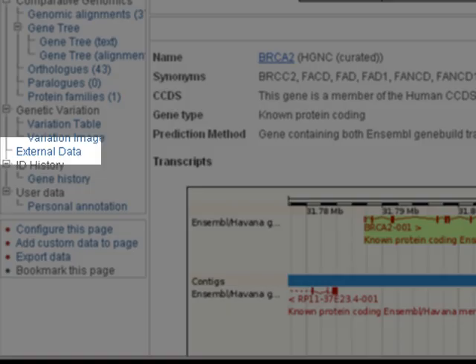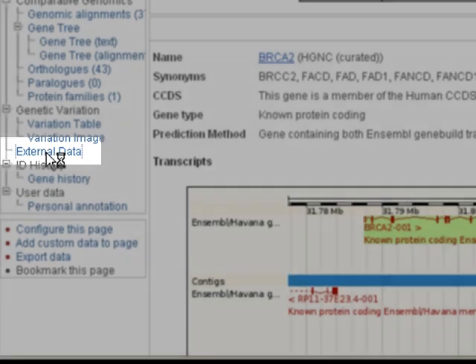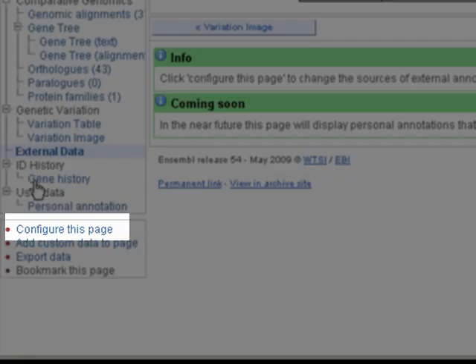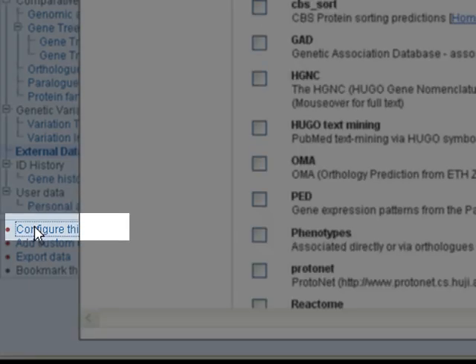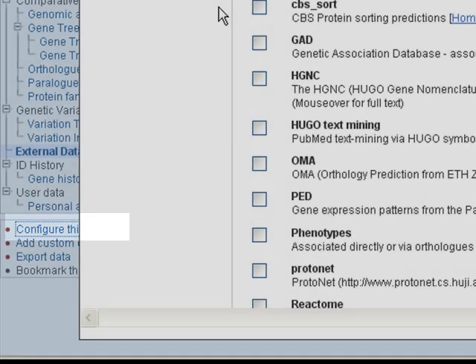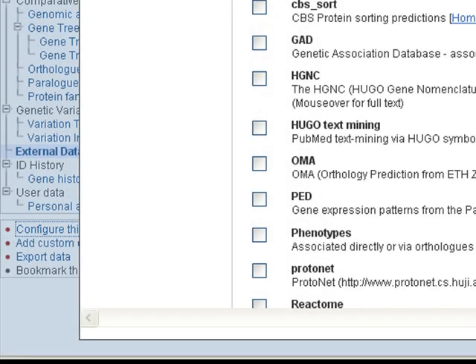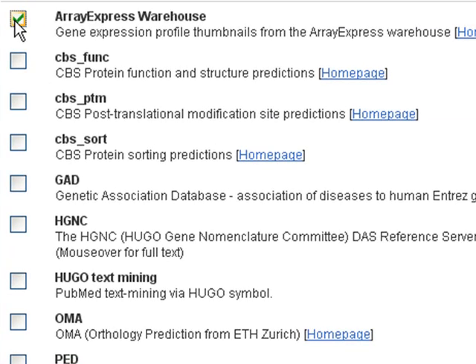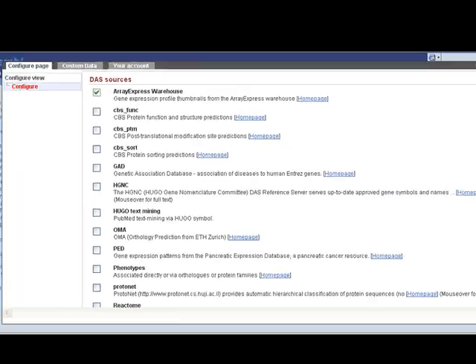If I go down to External Data, it tells me to click 'Configure this page' to add some choices there. I'm going to turn on ArrayExpress Warehouse Data. Save and close.